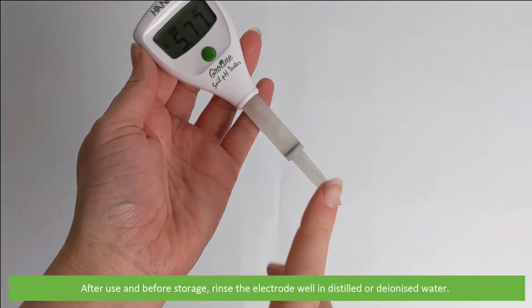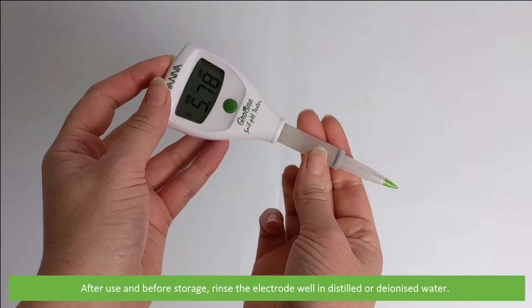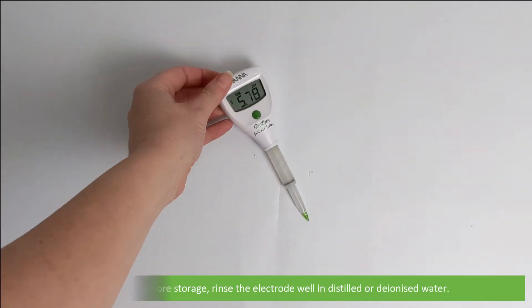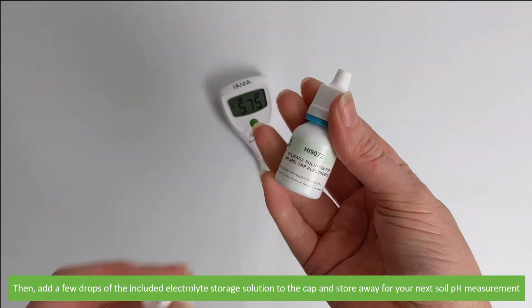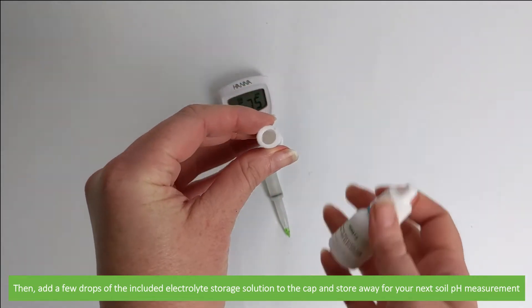After use and before storage, rinse the electrode well in distilled or deionized water. Then add a few drops of the included electrolyte storage solution to the cap and store away for your next soil pH measurement.